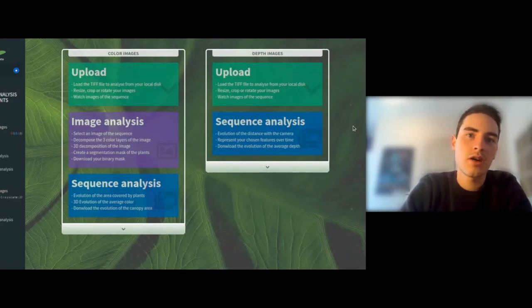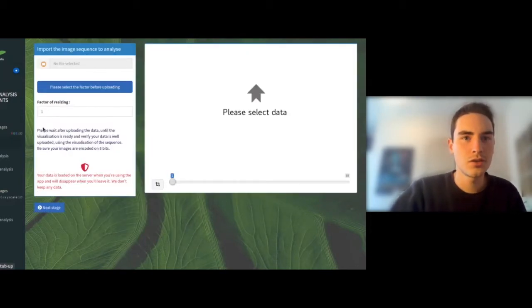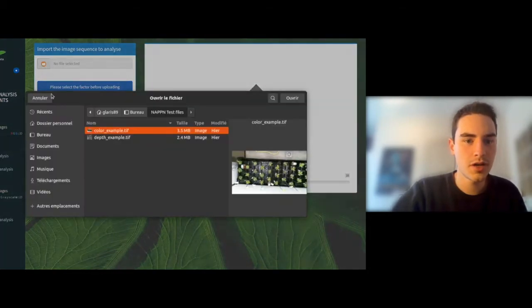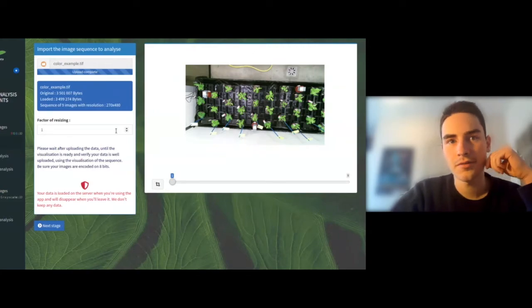Based on this, we are going to analyze the evolution of depth, color, and the covered surface of plants. So we'll start with a color example. Here we have salads in top view and we want to characterize their growth.